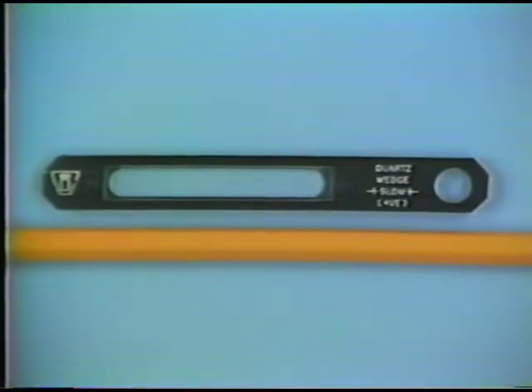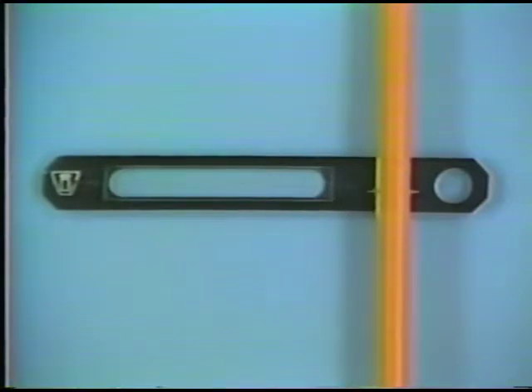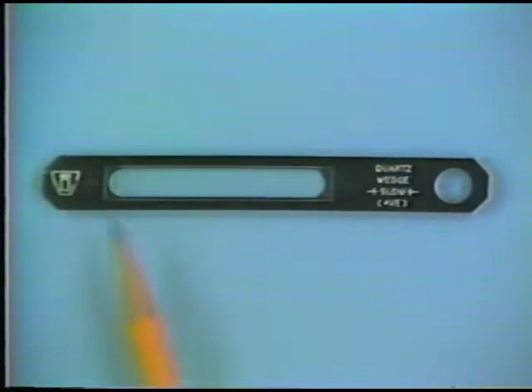And this is against most of the convention. This one happens to be made in Britain, and many British accessory plates have their slow direction along the accessory plate. Most accessory plates made in other countries will have their slow direction across the accessory plate, and you should very carefully notice on your accessory plates the position of the slow direction, because it will make a difference in the optical tests. And the quartz wedge is used by sliding into the microscope slot and watching the dynamic changes that you can see within the microscope as you insert the quartz wedge.